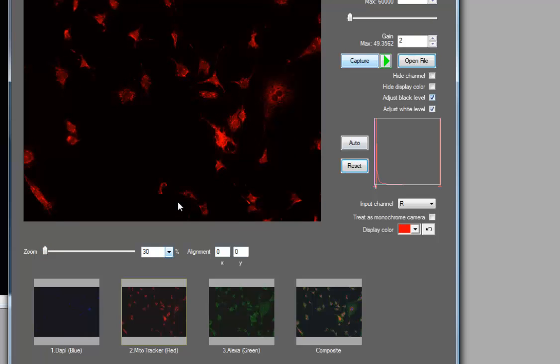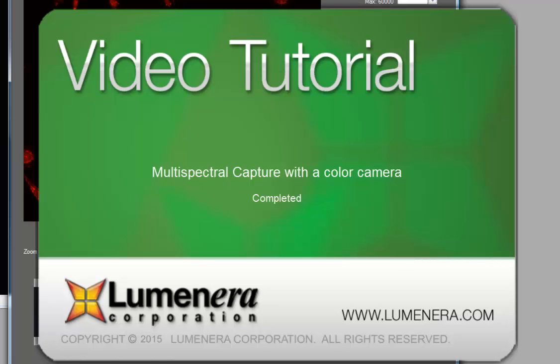So that, in a nutshell, is the color composition capability that's part of the new Multispectral Capture Wizard. If you have a monochrome camera, you can review the Monochrome Capture Multispectral Wizard tool video tutorial. And don't forget that there's the Multispectral Settings video tutorial as well. And that concludes our video tutorial for color camera multispectral capture.